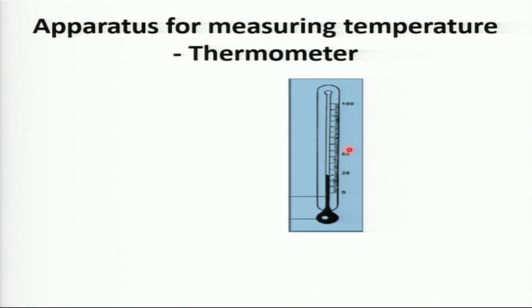One is working, let's say, under 24 degrees Celsius, the normal room temperature. Another one, let's say, is working beyond that temperature. The time it will take for the reaction to finish will be different. Why? Because temperature speeds up the rate of reaction. Is that clear? So we need to be having a thermometer in a chemistry laboratory, because as we start to work, you first measure the temperature you're working in.